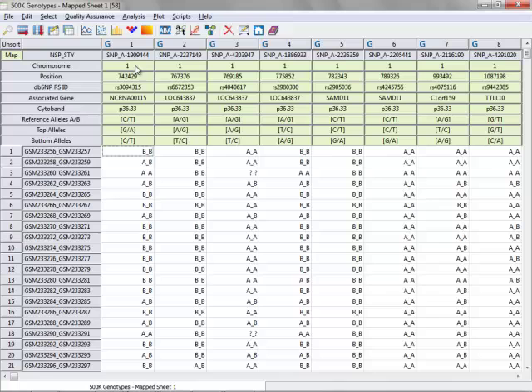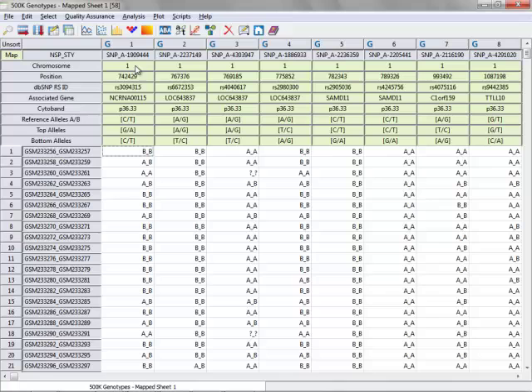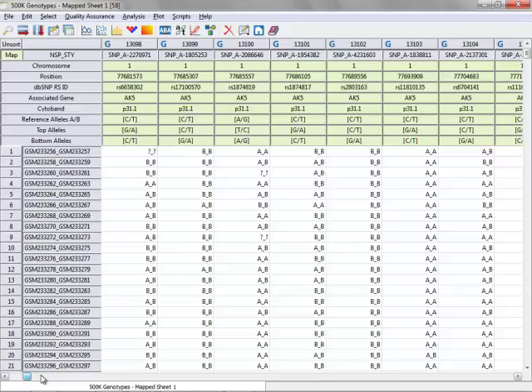You can also see that the markers are now arranged in genomic order, with chromosome 1 first, all the way through chromosome X.